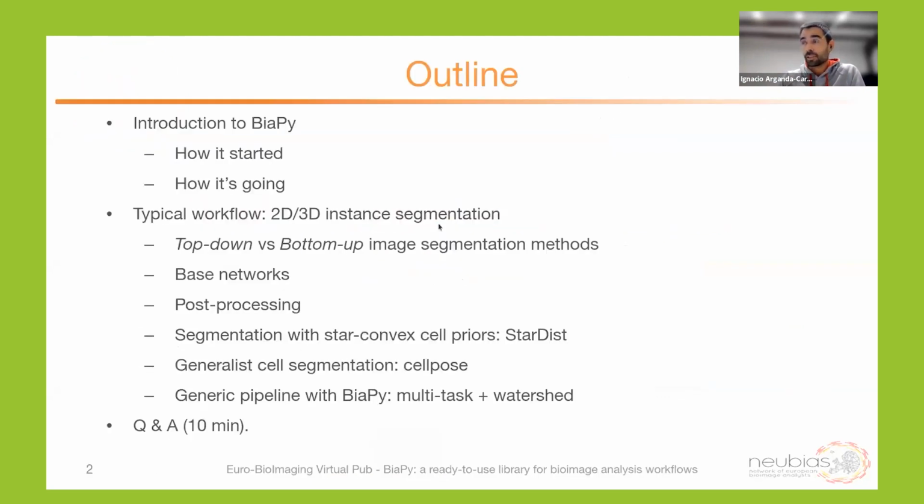So what I thought for the talk is to divide it in two parts. In the first part, I will tell you how this whole thing started, how it is going, the current state of things in the library, what you can do and you cannot do, which is also important. And also because I think it's a very recurrent problem for all of us, I would focus on one of the workflows that is interesting, which is 2D or 3D instance segmentation of any kind of microscopy images. For that, I will go through the usual approaches, what we usually use as problem representations to solve this kind of problems, and what we propose in our library to hopefully have a generic solution to it.